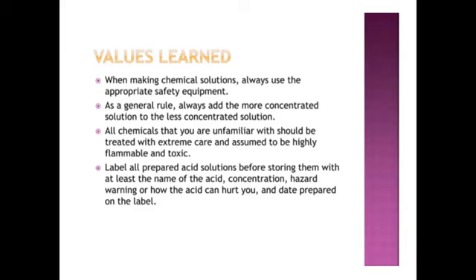And that is why your nose mask, your hand gloves, your laboratory coat, your eyeglasses, and everything must be available. Then whatever you have prepared and transferred to a reagent bottle, ensure that you label all your prepared acid and base before storing them, with at least the name, the concentration, the hazard warning, or how the acid can hurt you, and the date prepared.